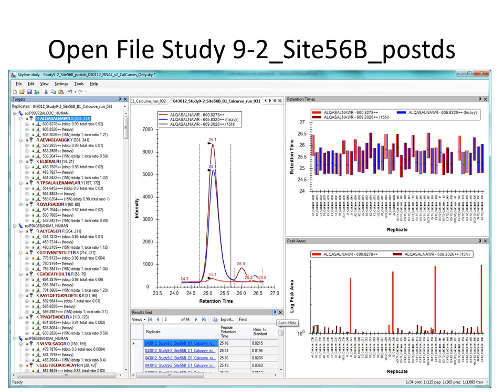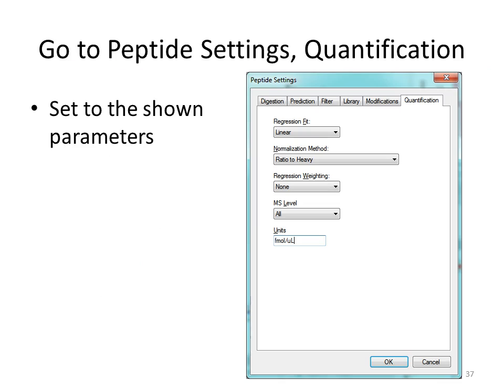It has more to the file name than just post DS. I just ran out of room. Everyone okay if I go to the next step? Okay. Oh yeah, if you see the thing for a spectral library, just skip it and open the file anyway. You don't need it for this.